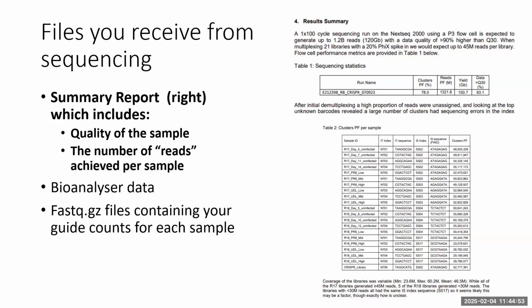The reason we did quite a few was to see the progression of the selection of the guides, also for the dropout of the essential genes. And you can see the I7 and I5 sequences. They're the barcodes. You can see they're slightly different for each of them. Essentially, once you've pooled all the samples, they all get sequenced. And then afterwards, they can bioinformatically separate those sequences based on the barcodes into your original sample pools.